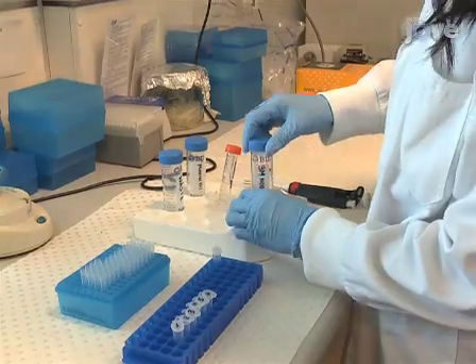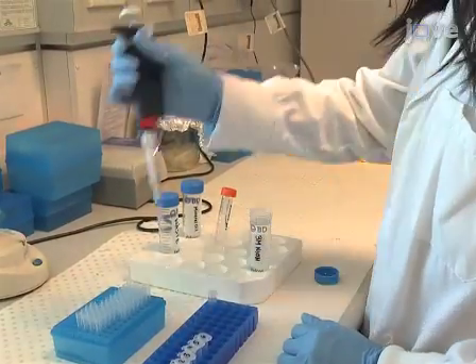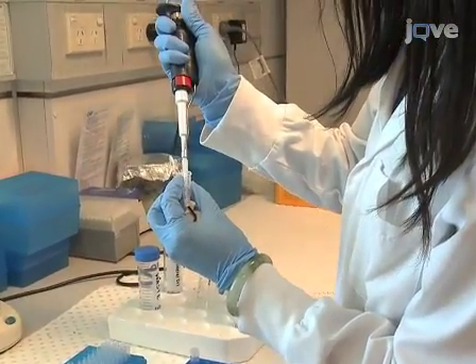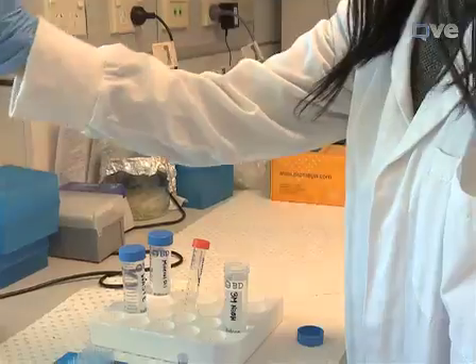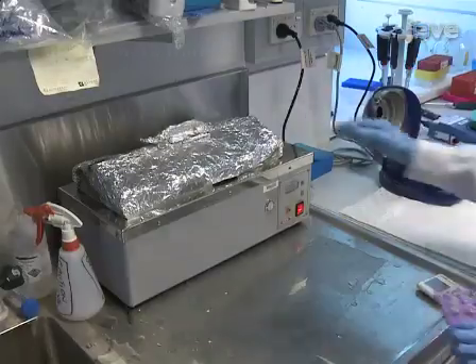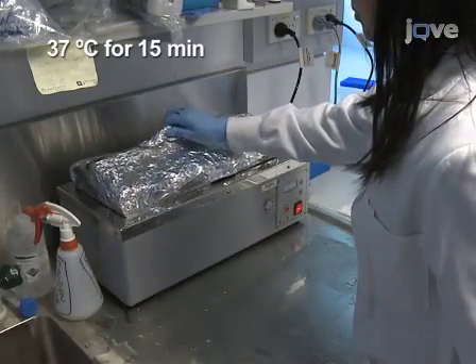The next step is to remove the bisulphite adduct from the uracil ring by desulfonation. To accomplish this, add 5.5 microliters of freshly prepared 3 molar sodium hydroxide to each bisulphite treated DNA sample for a final concentration of 0.3 molar. Then incubate the samples at 37 degrees Celsius for 15 minutes.